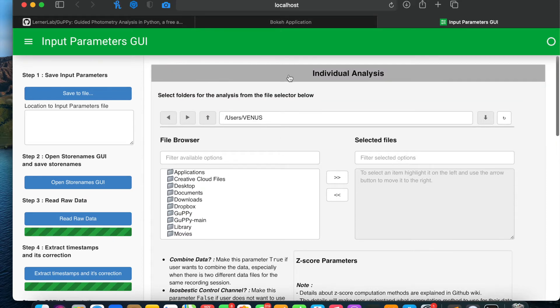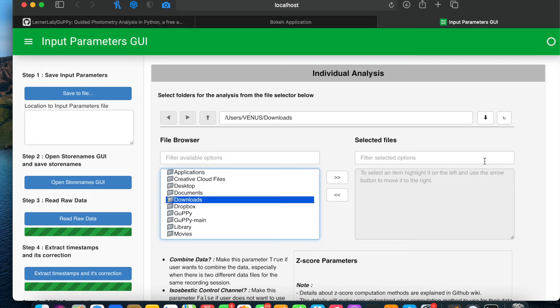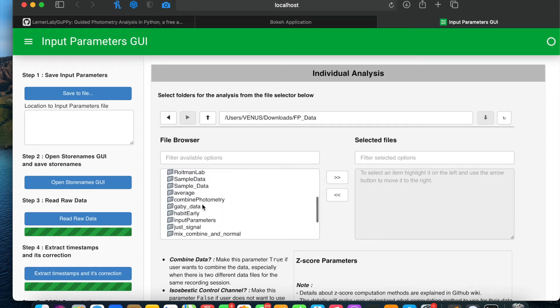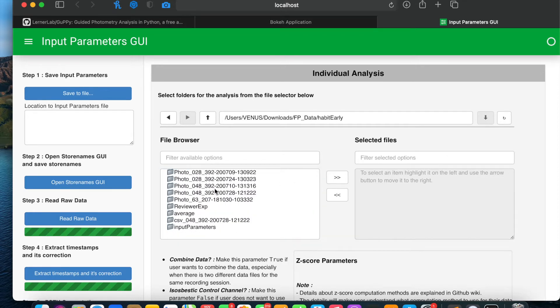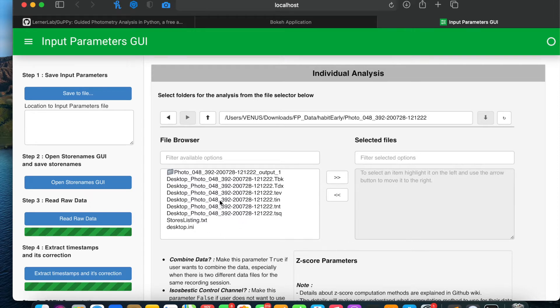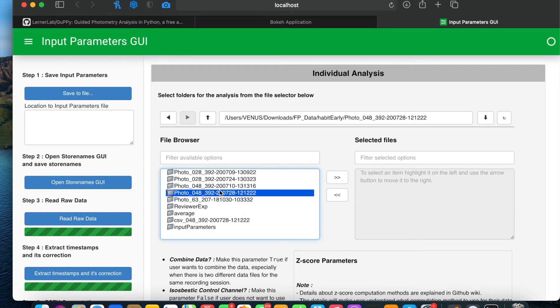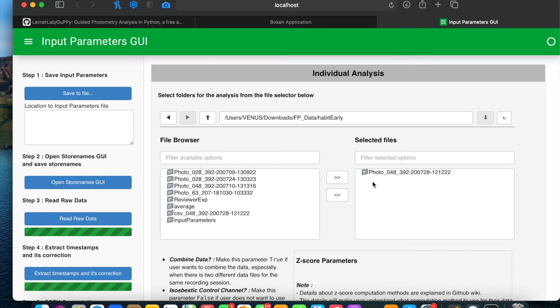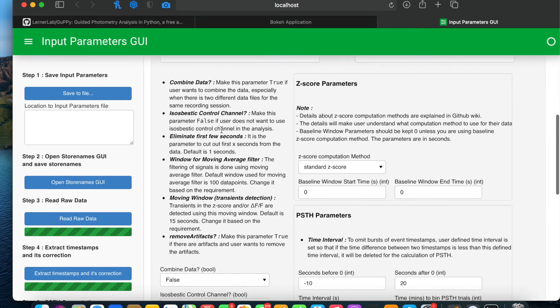In the individual analysis section, here you select the folders in which your data is present for the analysis. You select the folder and move it to this side using the arrow key. I am using data collected by TDT systems. If you open this folder there are different files present. I'll move this whole folder, which has data for this recording session, to this side. Some of the parameters are already explained on the home page.